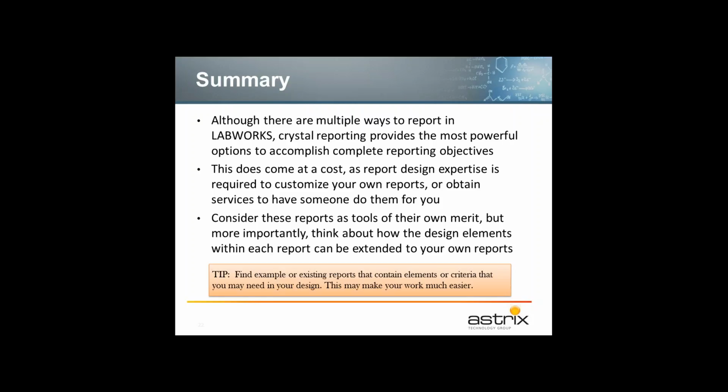And a tip here, and what I always found when I was learning Crystal, is find existing reports. There are several canned reports within your Crystal folder in your LW data folder that come with your LabWorks installation. Load those up and play with them. You're not going to hurt anything. Play around with some of these features that we talked about today and try to do a design element that really meets your particular needs. And before long, you'll be your own expert on Crystal reports.